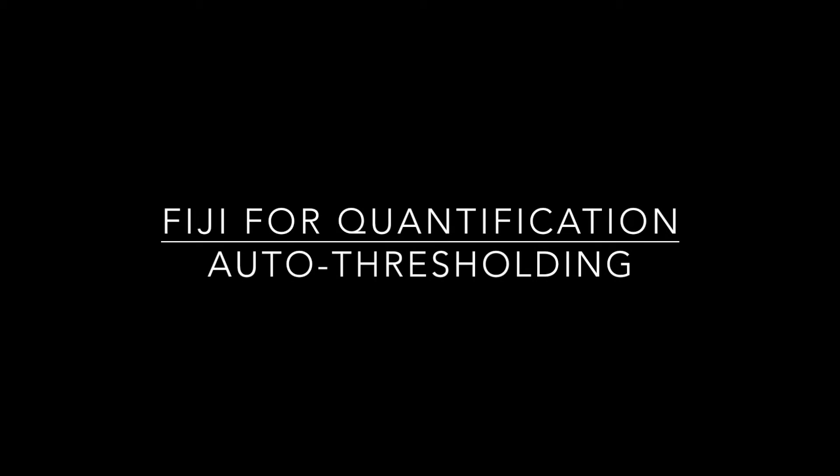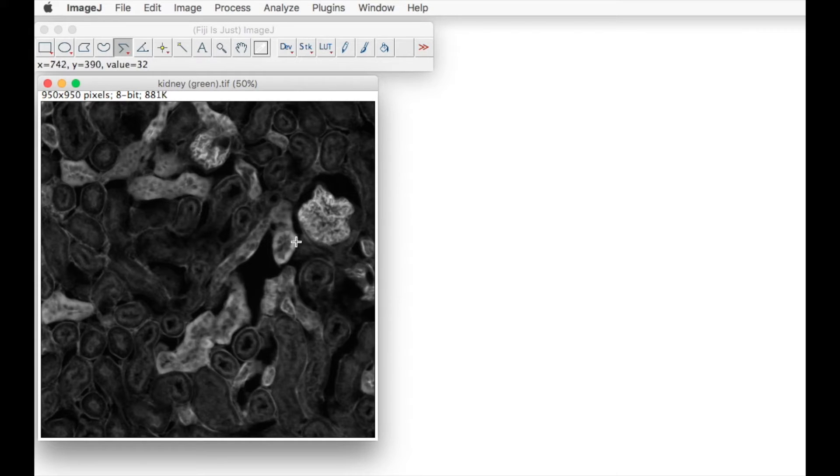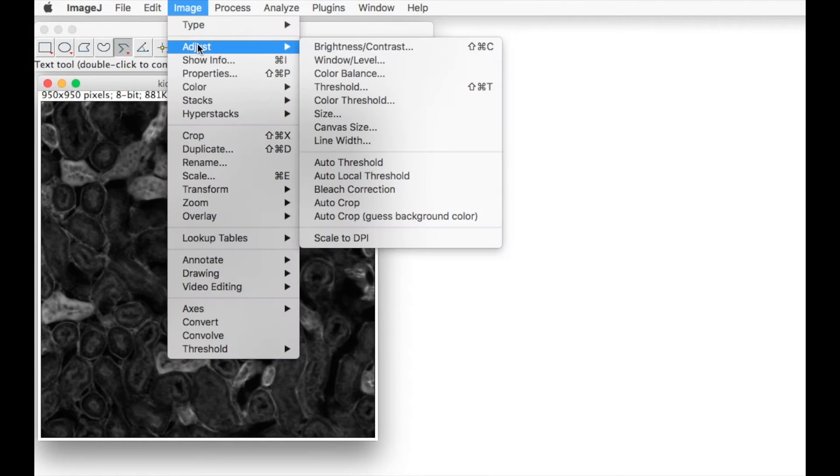This tutorial takes us through the steps for using the auto threshold function. In this example, we want to threshold the bright parts of this kidney tissue.